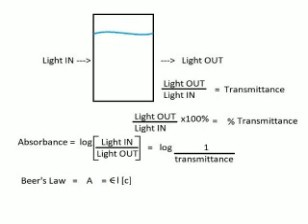Beer's law says the absorbance of the sample depends on 3 things. 1, the extinction coefficient of the thing absorbing the light. The better it is at absorbing the light, the higher its extinction coefficient. Second, L, the path length. Through how much of the solution does the light have to pass? And finally, C, the concentration of the absorbing species in solution.